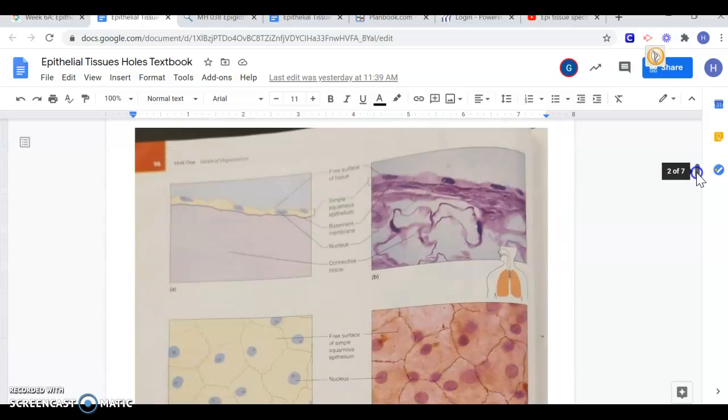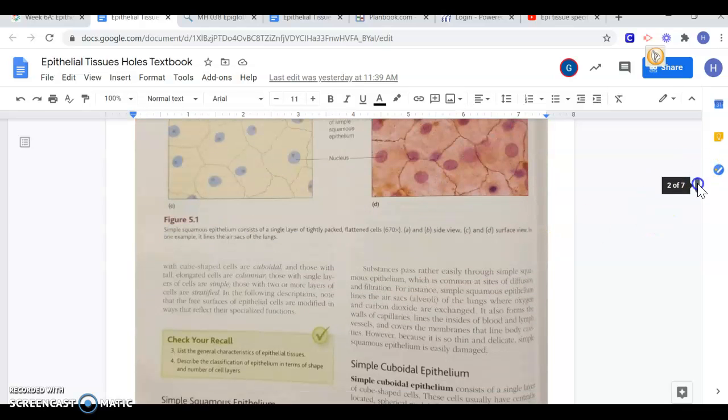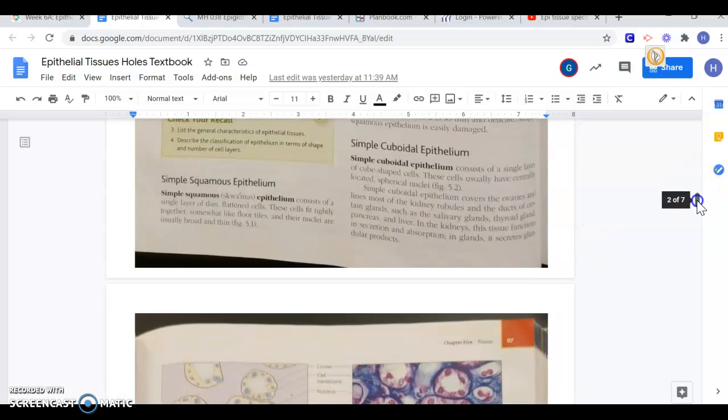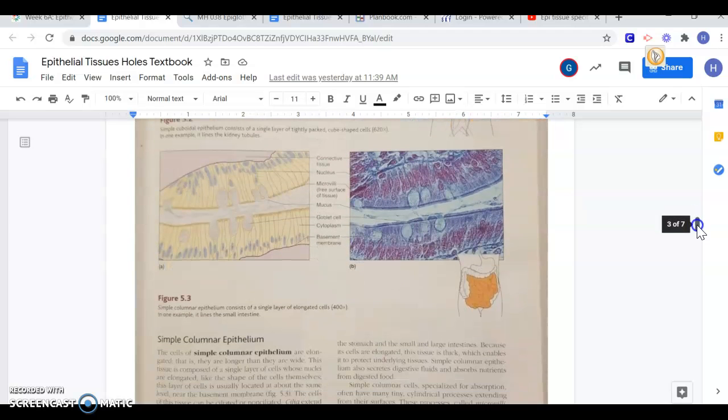I think the most applicable things are the pictures. If you see on the left-hand side, there's a drawing. On the right-hand side, it shows the actual pictures taken under the microscope. And then you see in the middle, they have everything labeled, so you can hopefully identify what's what. When you scroll down on this page, it then tells you where these samples were taken from or additional information. And it also talks to you more specifically about each of these types of tissues, so it really does come in handy when you go to do this lab.